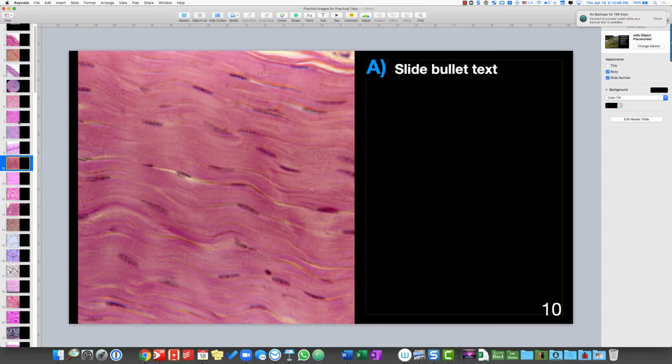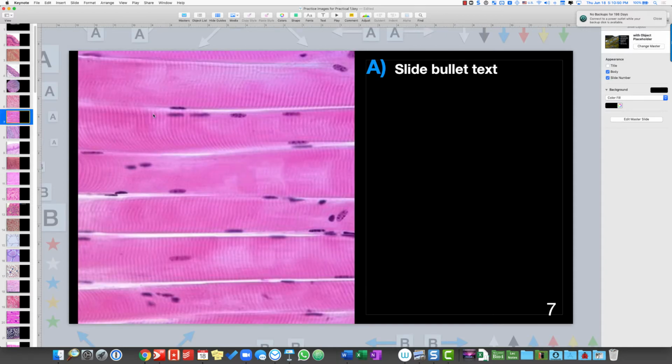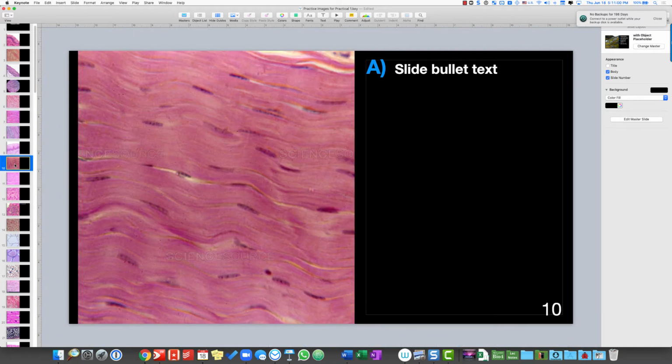That's one. Two, remember that these skeletal muscle cells are multinucleated. You can see at their margin there are numerous nuclei associated with each cell. Finally, if you see this waviness to it, oftentimes this is more indicative of dense regular connective tissue. But after all, these two types of tissues are oftentimes closely associated, right? Because skeletal muscle is often attached to bone through tendon.